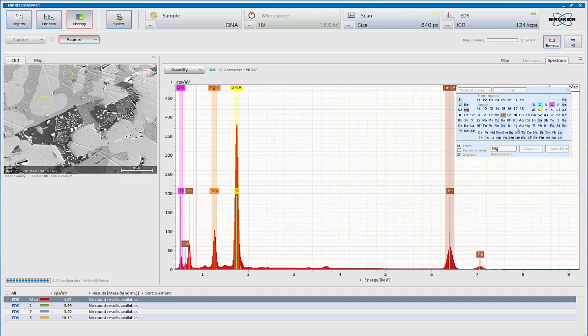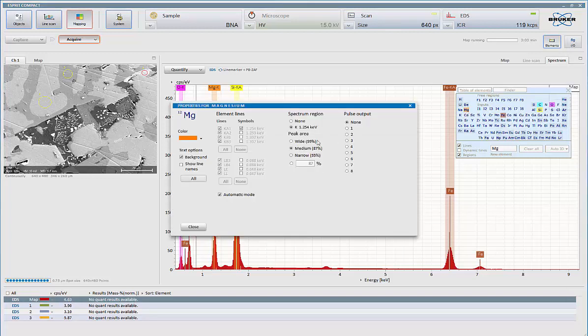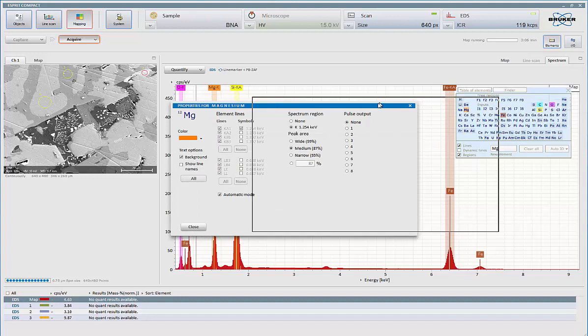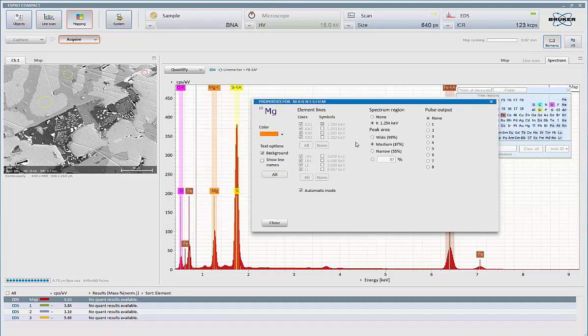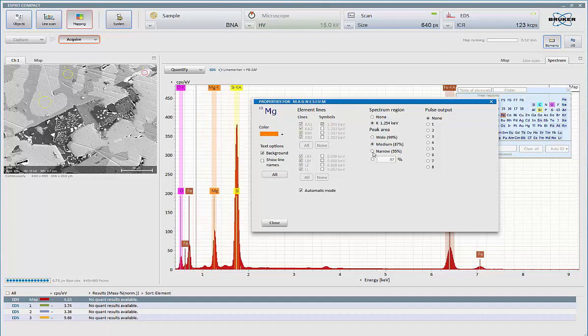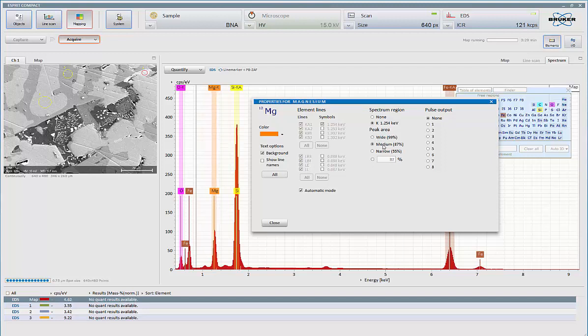Now those are all adjustable. If I press the right mouse button on any element, this is where I can come in. And if I wish to make a ROI wider, normal default, narrower, or anything in between, I can set it myself. Medium is about the normal. This is roughly 1.2 times the full width half max, which is considered to be the optimal.